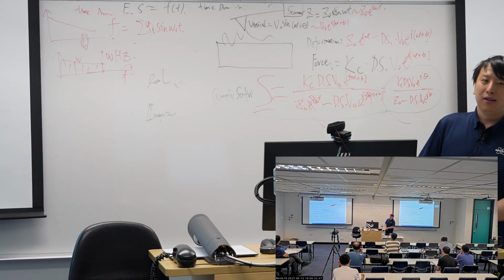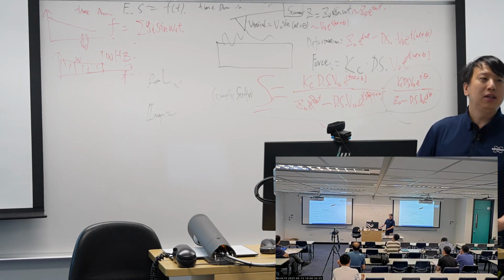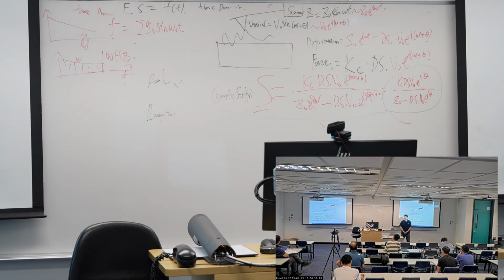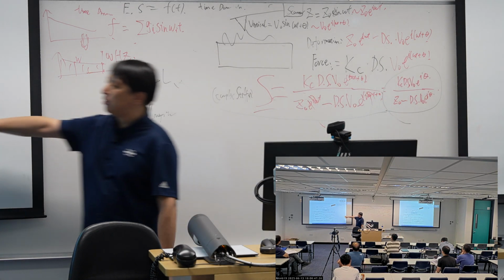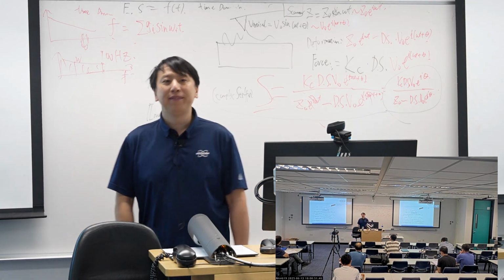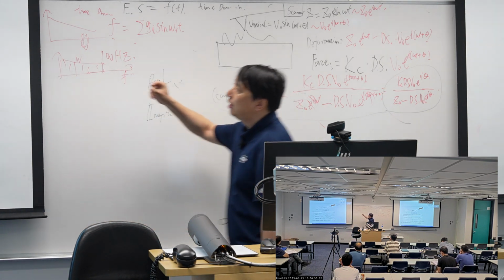You may need it when you publish the paper, and you can just use this in your methods part about how Bruker processes the number. Of course, you don't need to remember those equations because it's done by software.